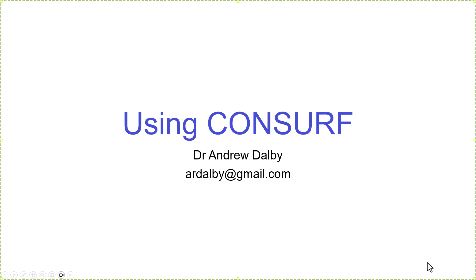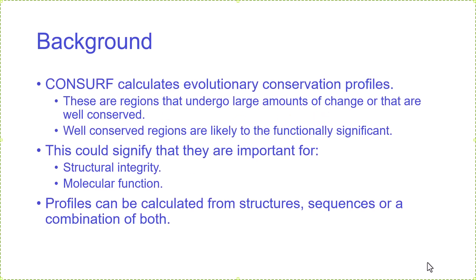I'm going to run through using CONSURF to look at structurally conserved regions and sequence conserved regions. You can work out evolutionary conserved profiles using this CONSURF online server. This will point out regions that undergo large amounts of change or that are well conserved, and there are average regions that fall in between.